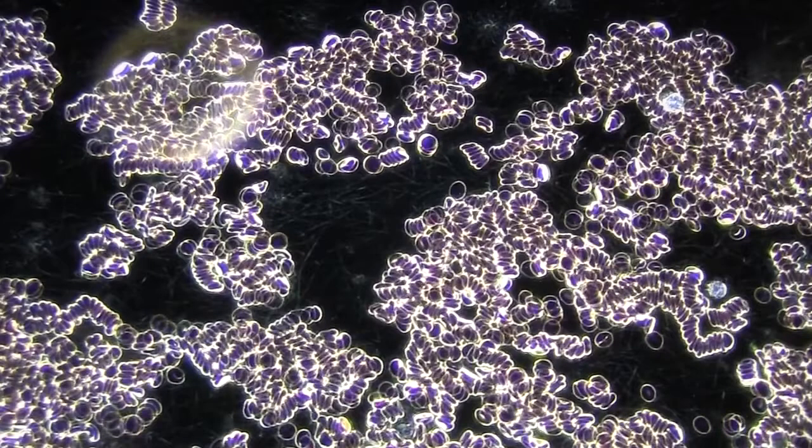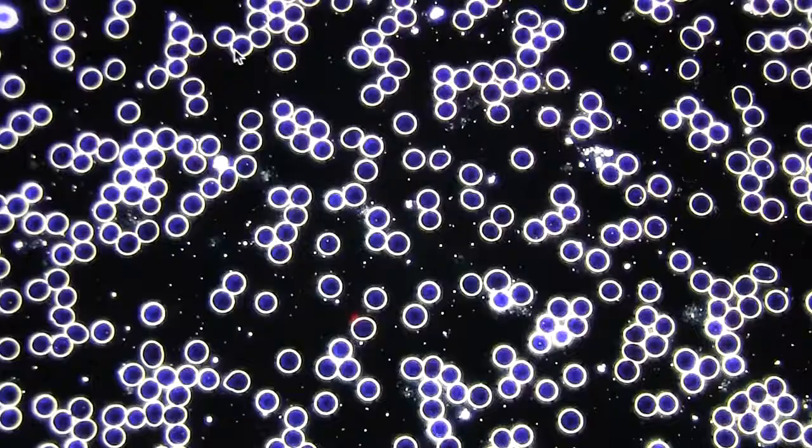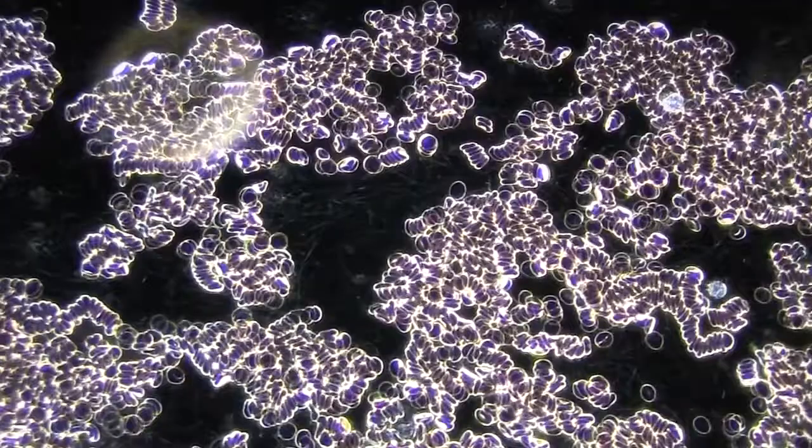What we have here is a lot of red blood cells stacked together in a formation called rouleau, where there's very poor circulation, very poor oxygen CO2 exchange. The red blood cells should be visible and separate like this one right here. Instead, they're stacked up, and there's multiple causes of that, including dehydration, poor digestion of protein, excess carbohydrates in the blood, sugars too high in the blood, and overall a low negative charge in the blood, where the zeta potential in the cells has been diminished, so cells just clump.